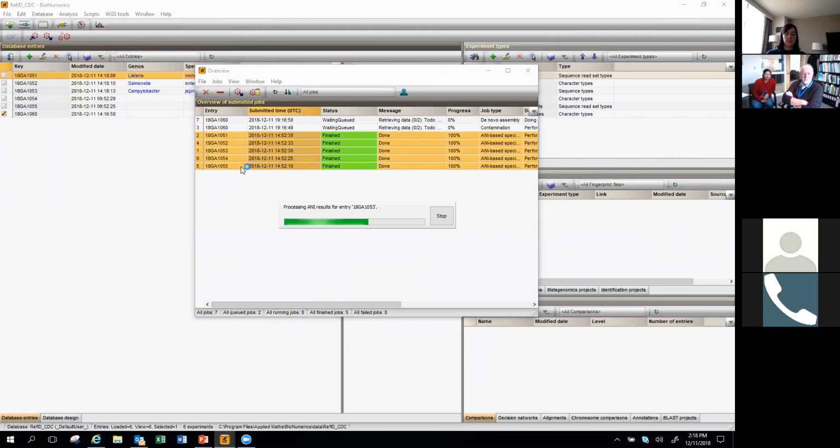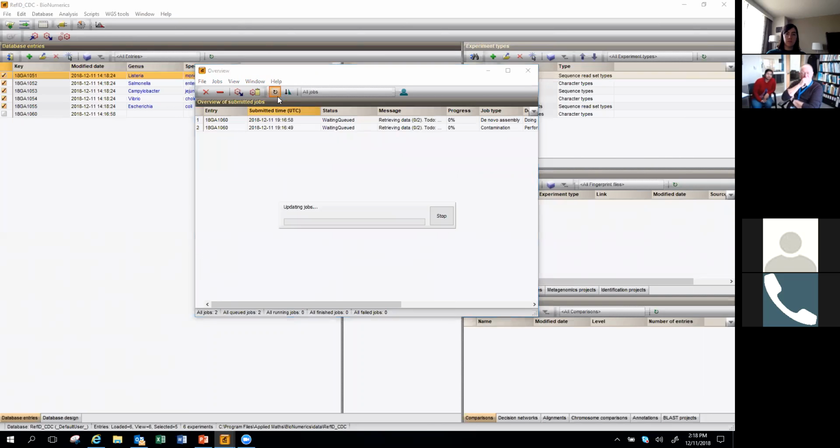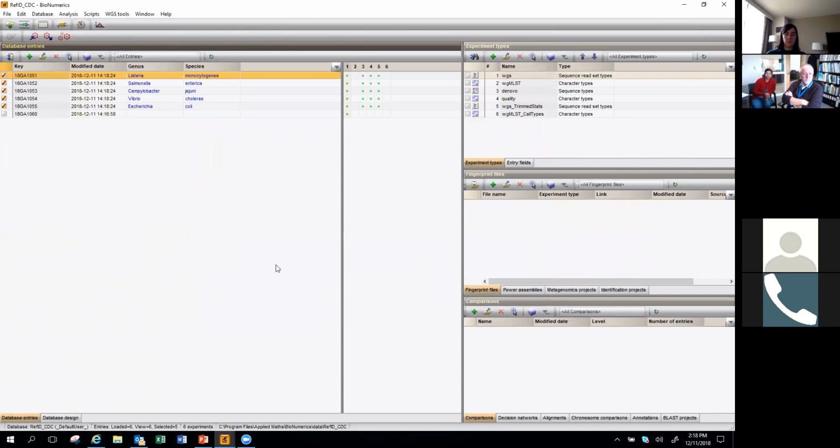So for these jobs, I've already submitted the de novo assembly, and then I submitted them again for the ANI. So what we're retrieving now is actually the ANI results, because the de novo results have already been retrieved. And so if that's done successfully, you'll see that 5 results were imported for 5 entries. And then these guys are still waiting queued. So we can close this window. This window does not have to remain opened, so we can close that while those jobs are being performed.